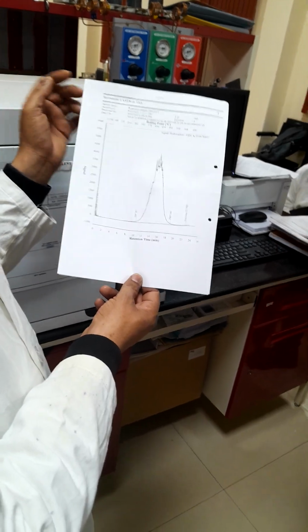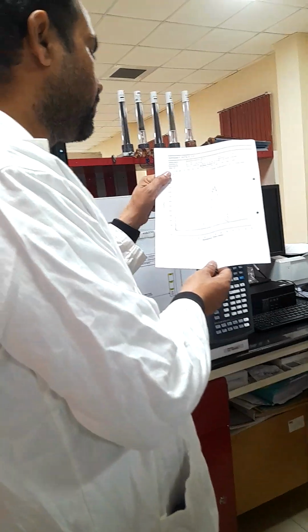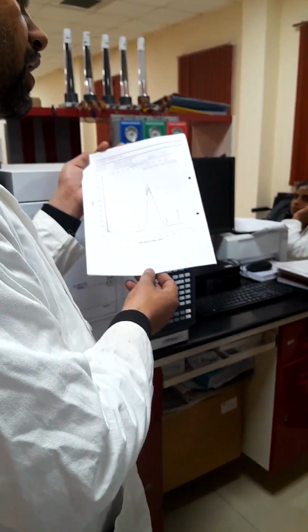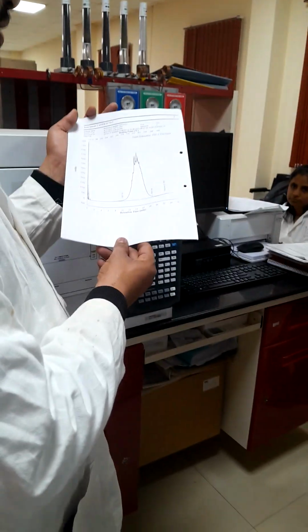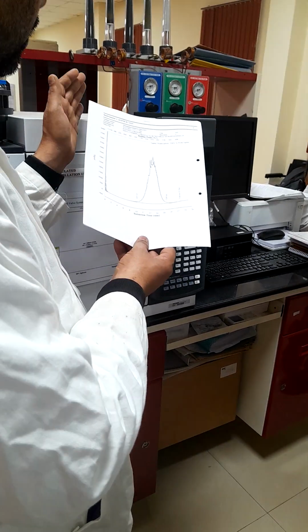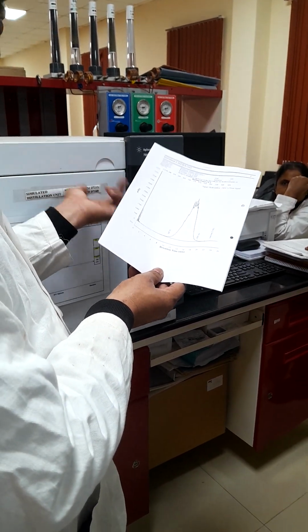Because in true boiling point in D86, when the first drop comes out, we notice it as the IBP for the sample. And the maximum temperature risen during the experiment is known as FBP, whenever we do D86 or any distillations. So here we cannot notice any drop, we cannot notice any final temperature.